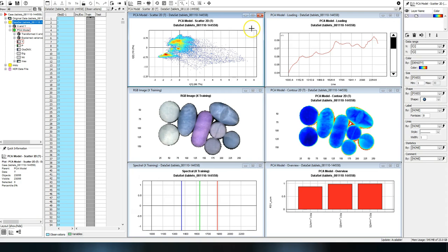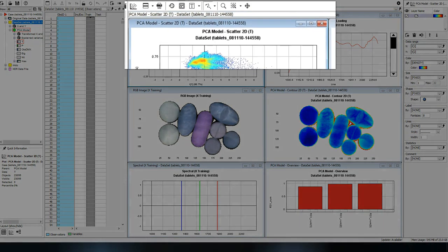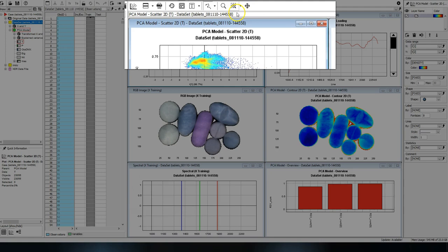On the top of the plot area, there is a toolbar for commonly used tools, for example to change the type of selection tool.